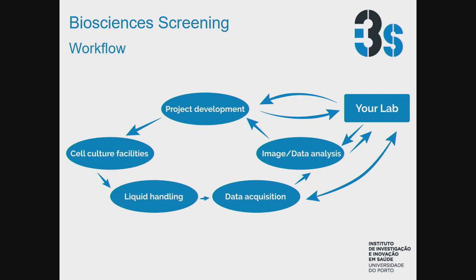But of course, you can approach the platform just for doing data acquisition and image analysis. There are several ways you can enter in this workflow.